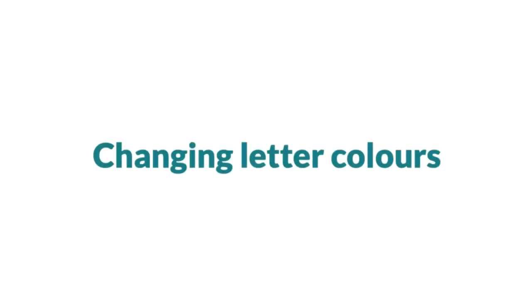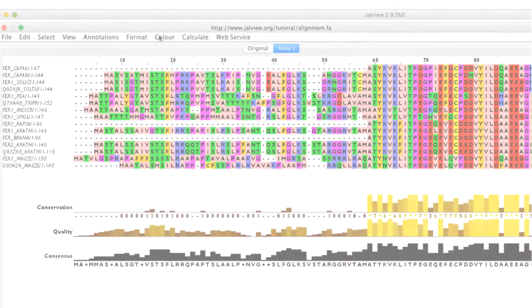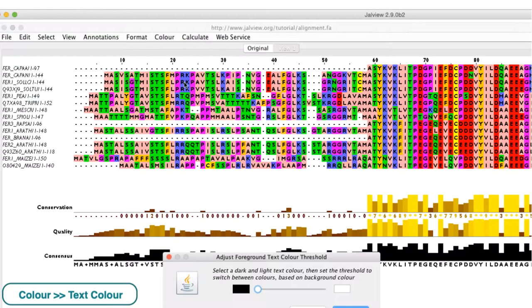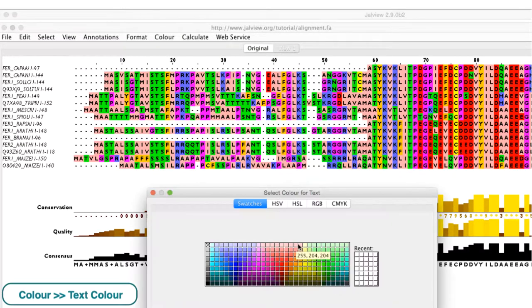The colors of the letters can be changed in the color menu by selecting text color and then clicking on the required color.